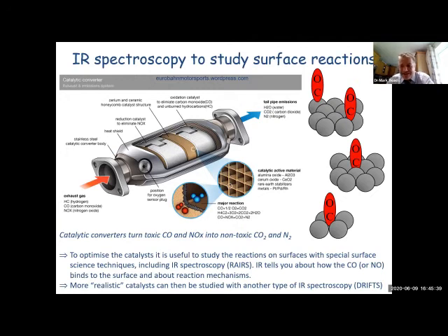Yes, you have to learn about it at A-level, and hopefully when things get back to normal, you'll be able to use one of these instruments yourselves. But also it's used in industry. It's used commonly in forensics, as I mentioned, because now you can appreciate how rapid, how sensitive, and how versatile this particular instrument is for industry as well. So I believe my time is up. Thank you very much for your attention.